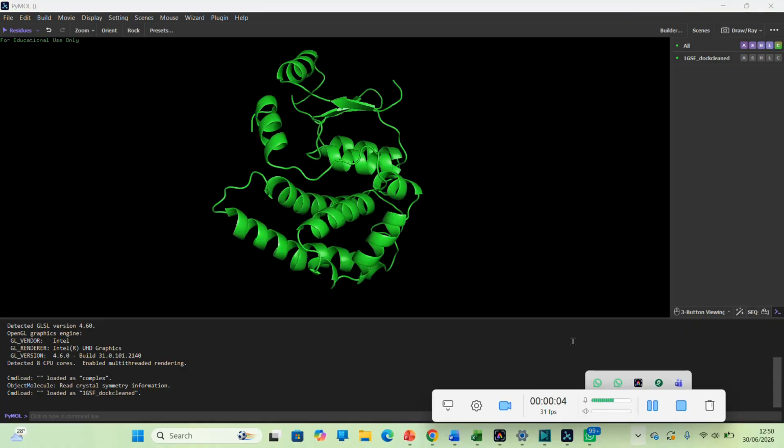And in this video, I'll show you a few steps in PyMOL that can dramatically improve the quality of your images after docking for publications, your theses, presentations, and even for conference posters.